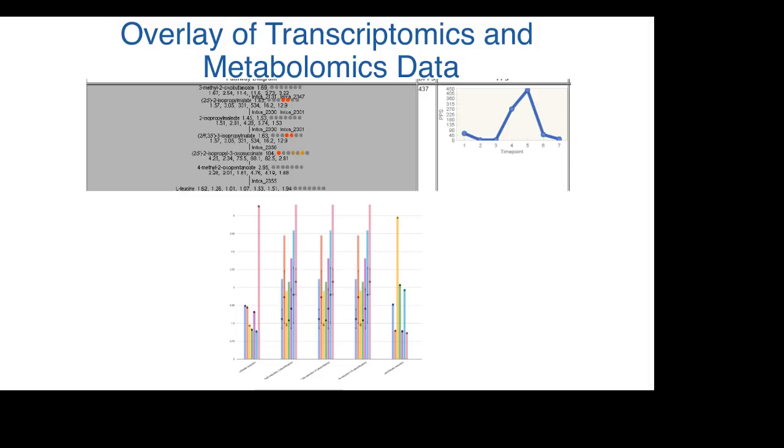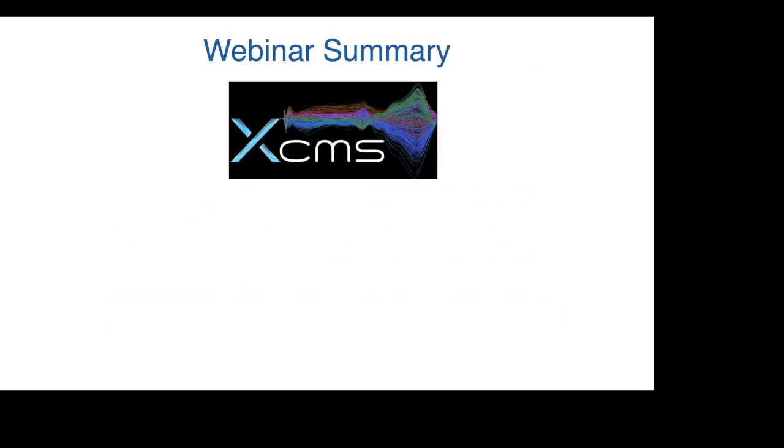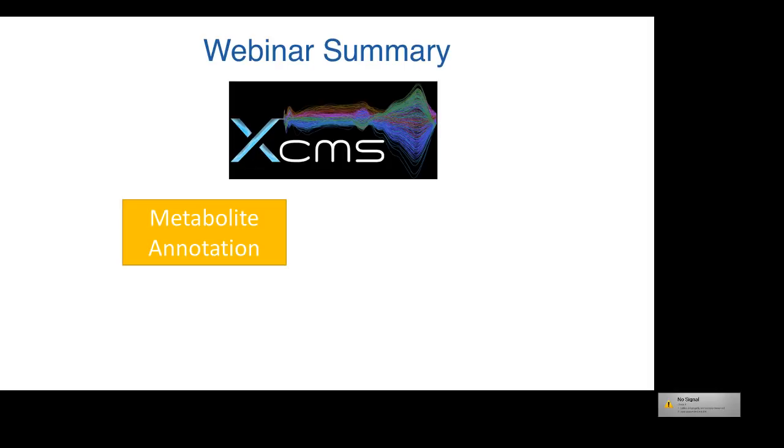So everything was really coming together today, both in terms of the XCMS Systems Biology and our new powers with automated annotation, helping us to view our large-scale systems biology data in a much more robust manner to get at mechanistic understanding. So taking that back to summarize today's findings, we saw a lot of fun things that we're able to do within XCMS and METLIN.